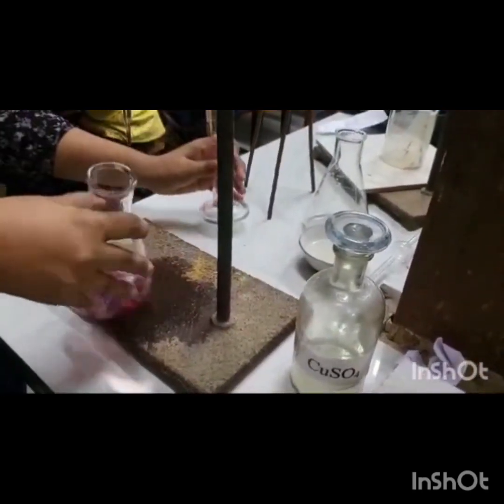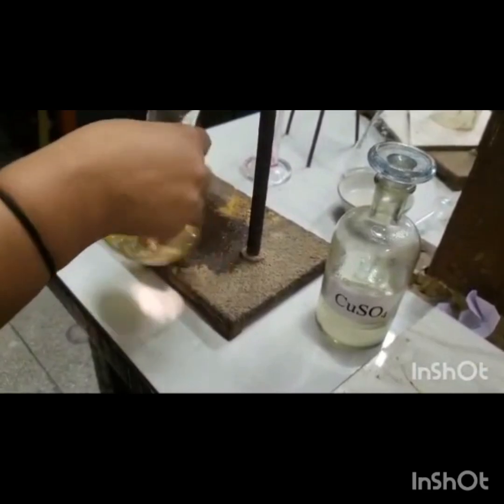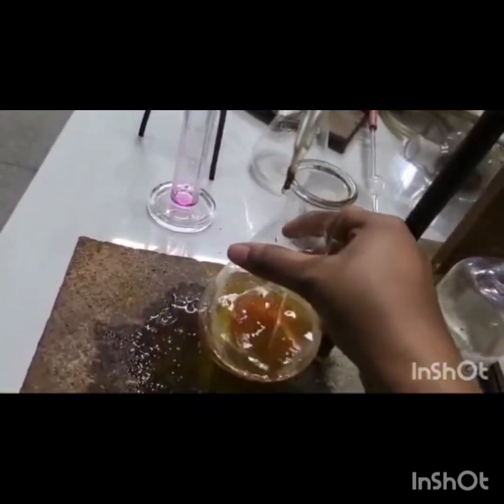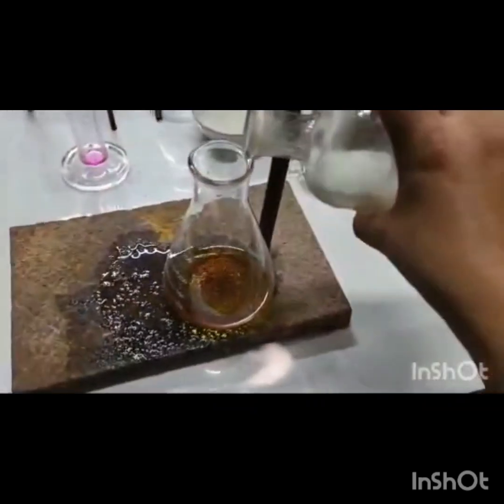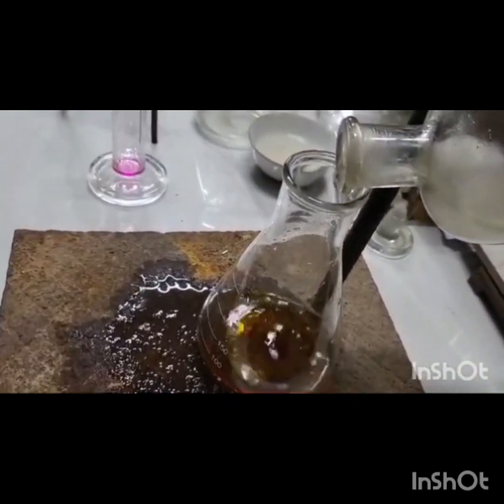Now we will titrate the solution formed. Also we will add some amount of starch to the solution. Here some amount of starch is added to the conical flask.